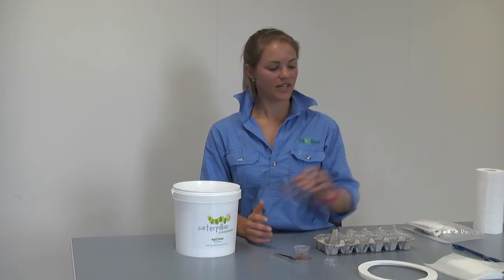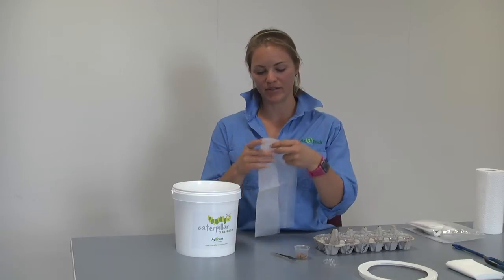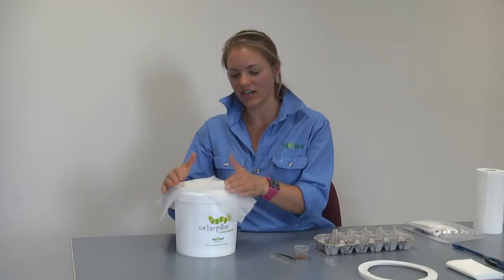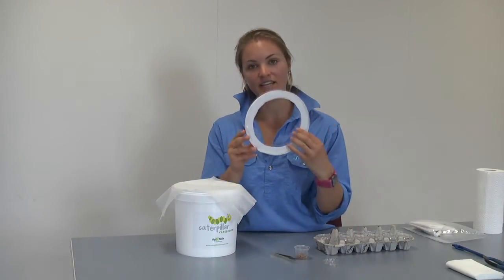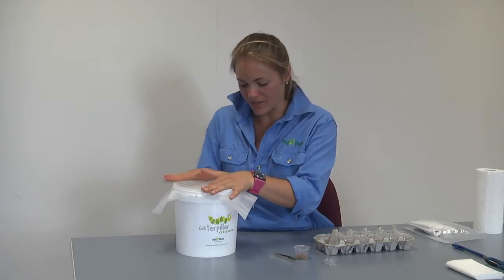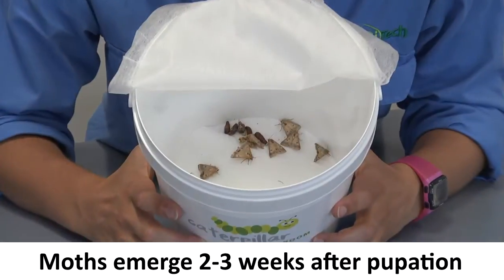Take a single sheet of the nappy liner provided in your Helicoverpa rearing kit and place it over the bucket so it covers the entire opening. Then take the lid that you cut the circle out of, place it on top, and secure it down firmly so it holds the nappy liner in place. Check your pupae daily for signs of emergence — typically this will occur between two to three weeks from when your larvae first pupated.